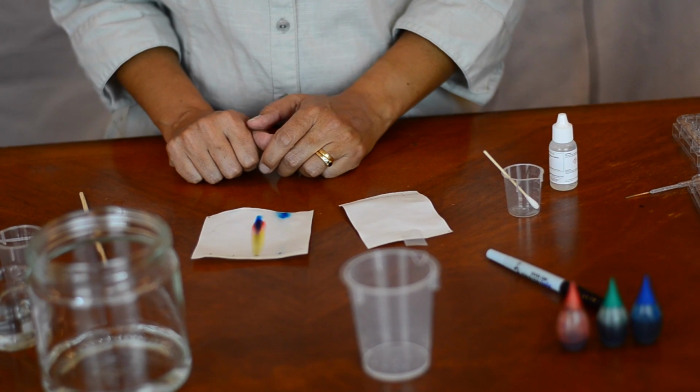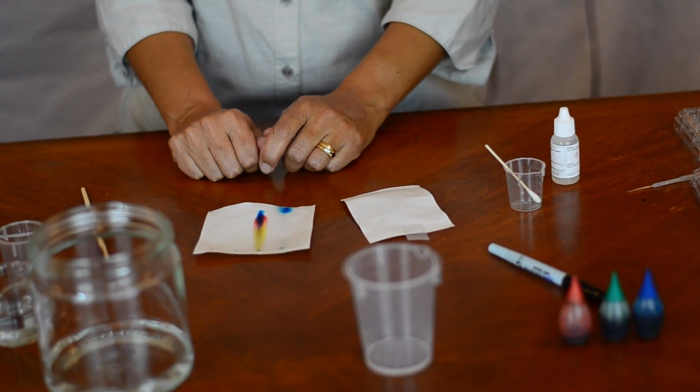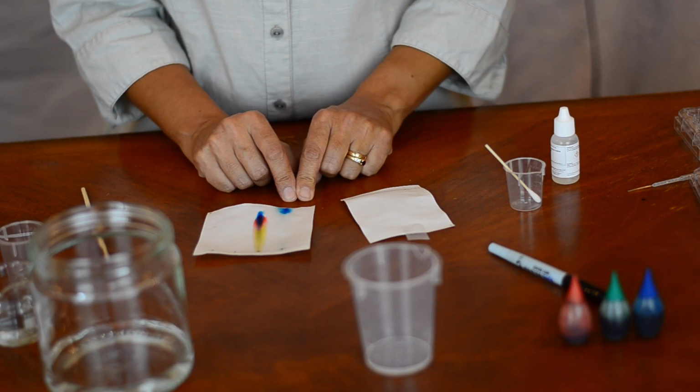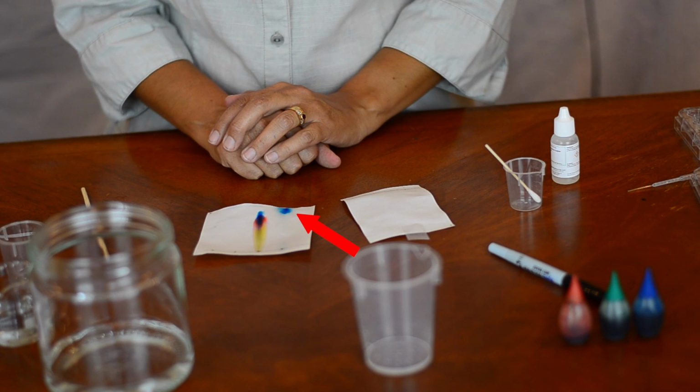So now, what we can see right off the bat is that my felt marker separated into different colors. You can see each constituent color, that there are several pigments used to generate that black color, and you can see that the pigments have separated. My food coloring apparently looks to be quite pure. I've just got a big blue blob that migrated up the paper almost right to the top.